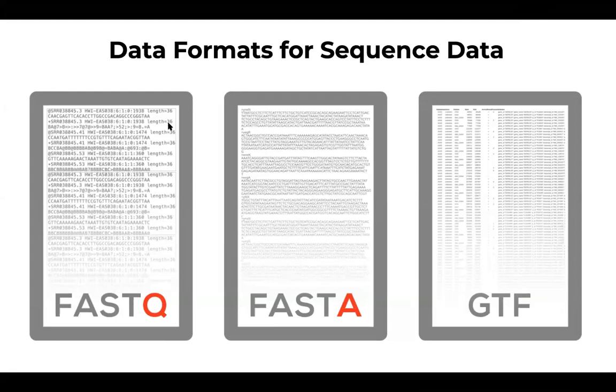The quality of the reads and the length of the reads determines how accurate our analysis can be and how trustworthy the different details that we find. For example, if we're talking about novel transcripts or even variations in exons, if we have longer reads and higher quality and greater abundance of reads, we will have a more reliable analysis.